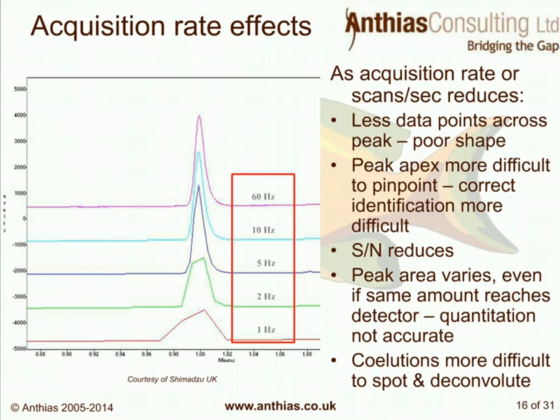As acquisition rate or scans per second reduces, we get fewer data points across the peak, and the peak shape becomes less clear and less reproducible. The peak apex is more difficult to pinpoint for correct identification. Signal to noise reduces, peak area varies, quantitation becomes inaccurate, and coelutions are more difficult to spot and deconvolute.